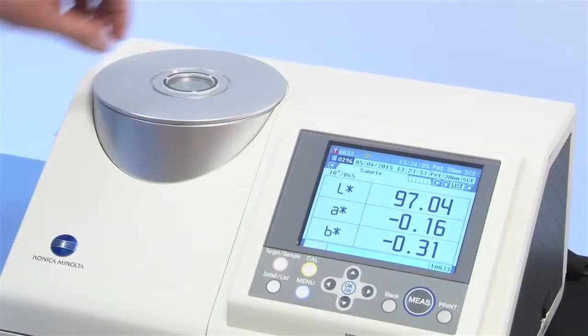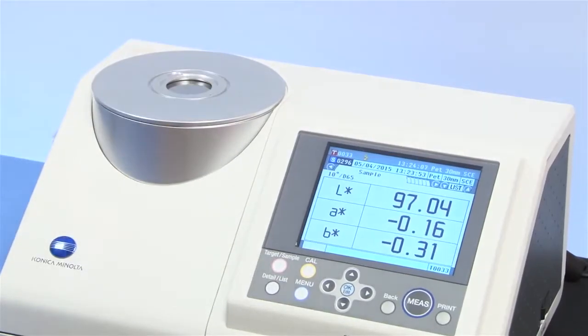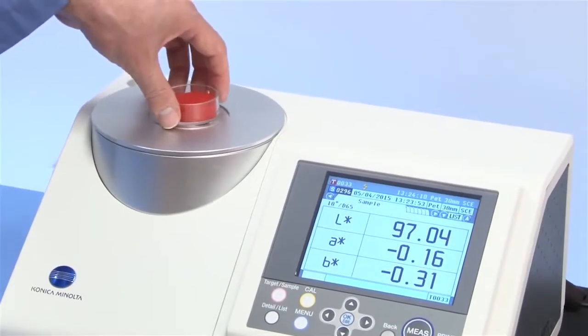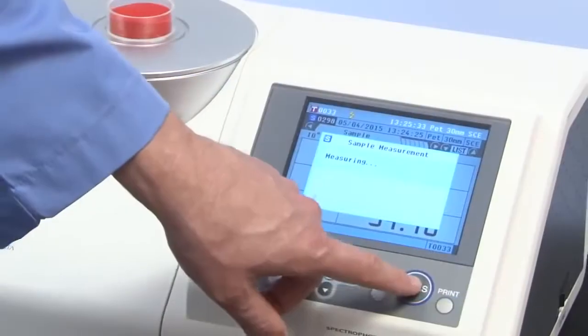This will normalize the instrument when measuring samples through a petri dish. Proceed to measure your targets and samples in reflectance mode as normal.